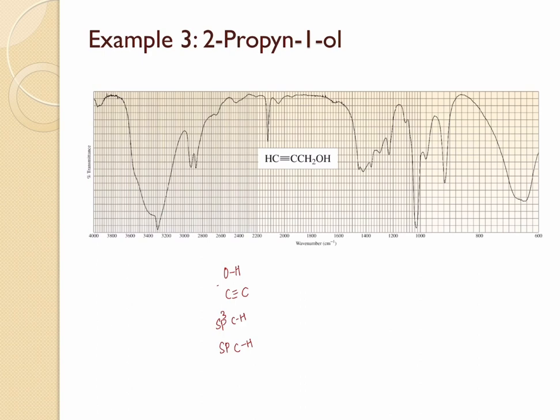So to begin with, here is going to be the absorption peak for OH, and since this is an alcohol, we have talked about how it's going to form hydrogen bonding, because of which this band can be really broad. Okay, so this is going to correspond to the OH. Now let's drop a line around 3000. So here is 3000.